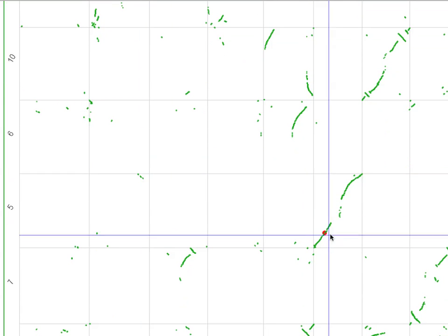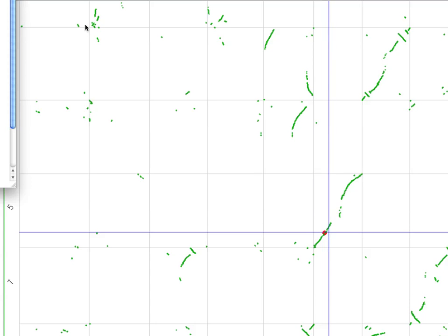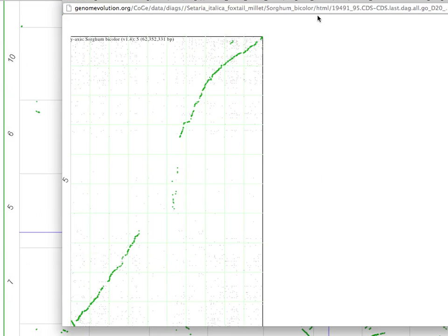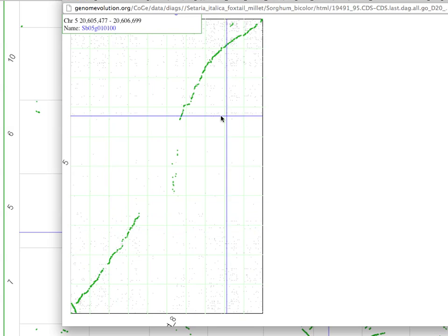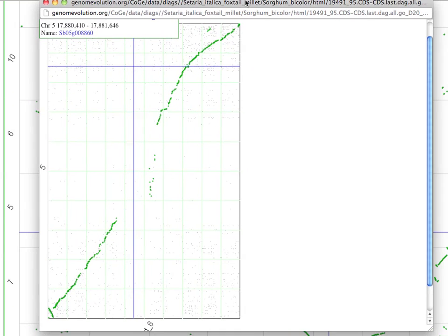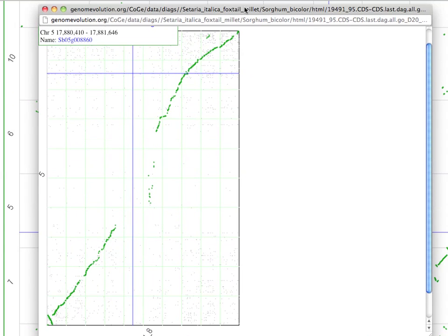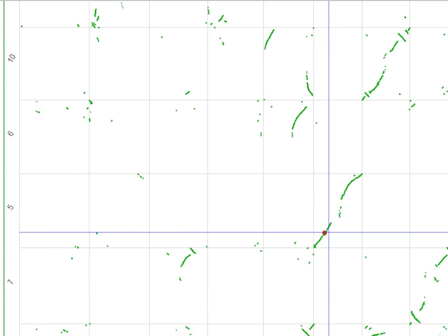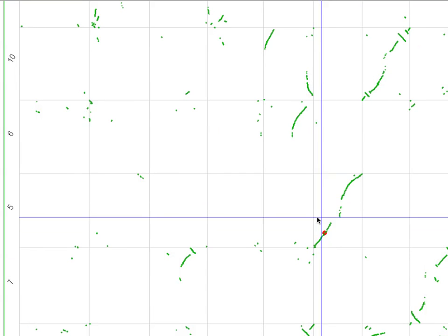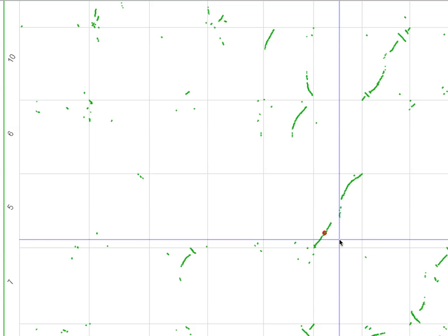And right there is my gene pair of interest. So it shows up as a red dot within the dot plot. It doesn't actually show up over here, per se, but that is definitely a feature that I can add in at some point in the future if people are interested. But this is just to show that this kind of analysis is possible to some extent.